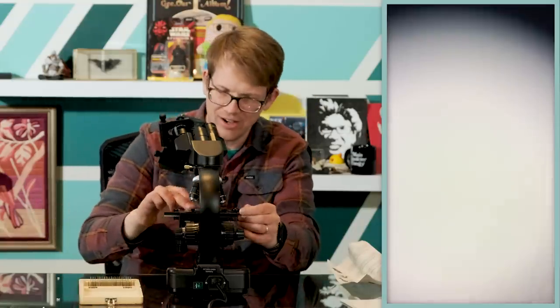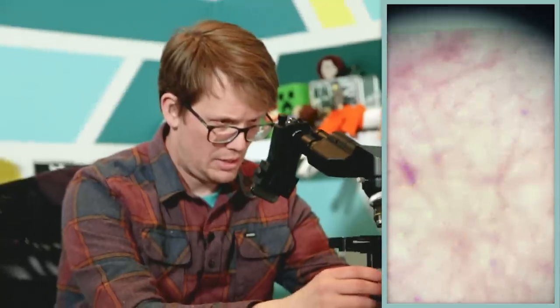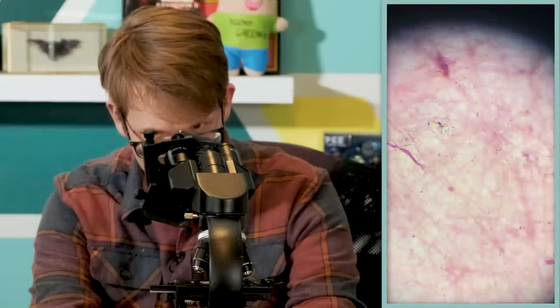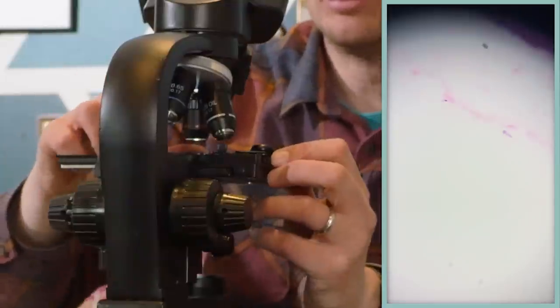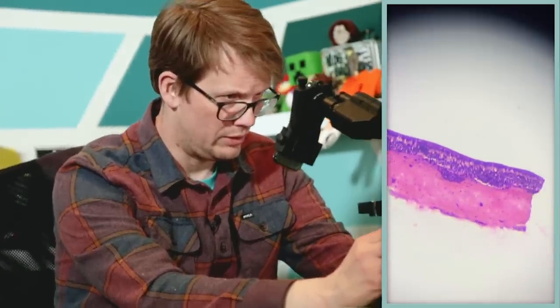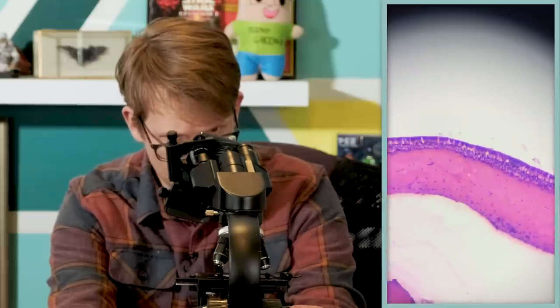This is going to be some loose connective tissue — my favorite kind of connective tissue. I've seen some pink. Let's try and focus. Hey — oh, gross. This isn't the sexiest of objects to observe. Ciliated epithelium. I actually do want to see some ciliated epithelium now that I'm thinking about it. Some beautiful cells here to work with. See all those nuclei in there? This is all stained, so it looks extra good.